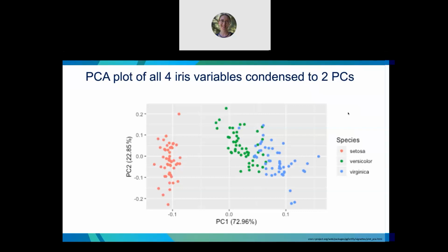That is a really fantastic explanation, Phil. Thank you so much. It's just really, really intuitive. I can't really visualize a 50,000 dimension fish tank, but I guess that's the whole point. We can visualize a PCA plot of it. And by the way, that's another benefit: 2 dimensions, as you said, is good enough for PCA. We don't really need 3. What that also means is that a 2-dimensional plot is a nice visualization. It's useful. Yes.